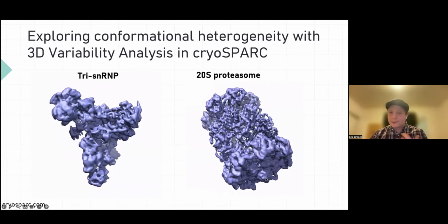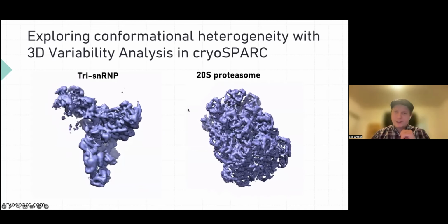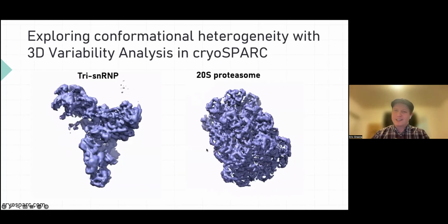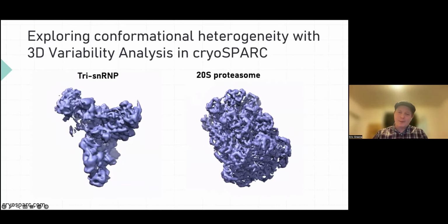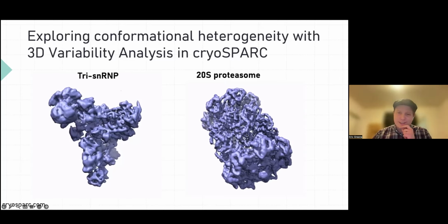We were largely concerned with the 19S regulatory particle, not pictured here. We just kind of thought that the 20S proteasome was just like this brick. It was a protease that didn't really have much conformational change. It certainly doesn't have the conformational changes of the 19S, but it's an EM standard too.